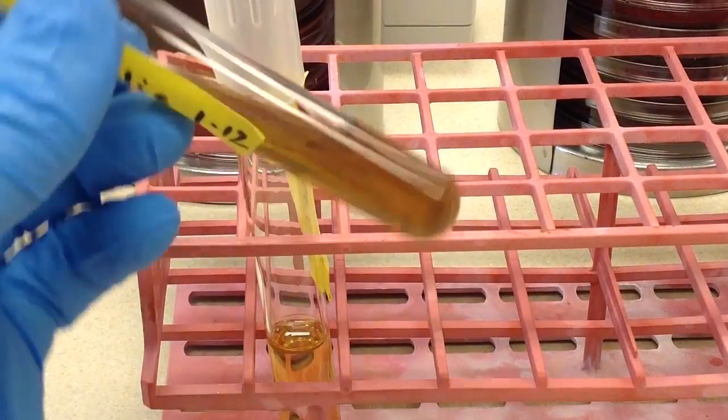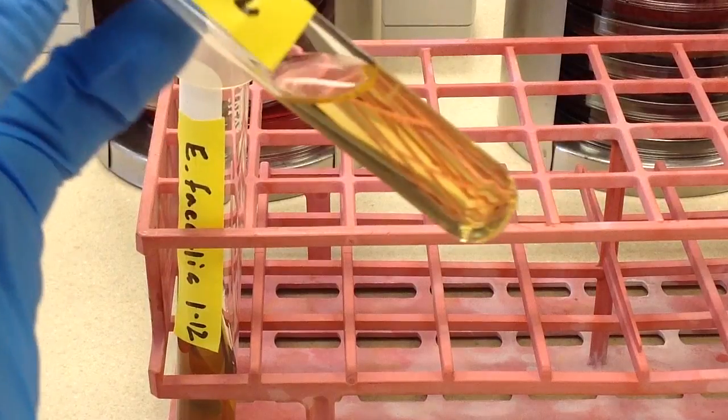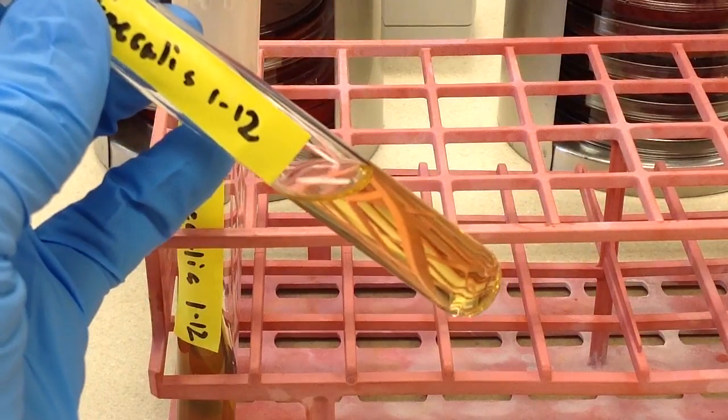And these tubes, the slants, of course we can turn and take a look, but you do not want to be tilting a liquid broth like this.